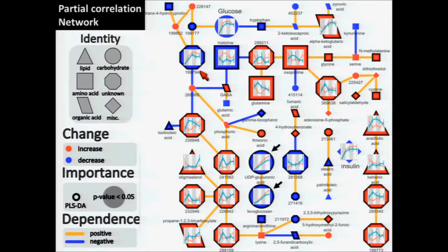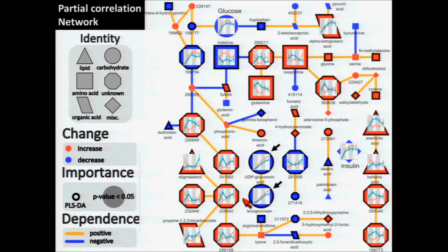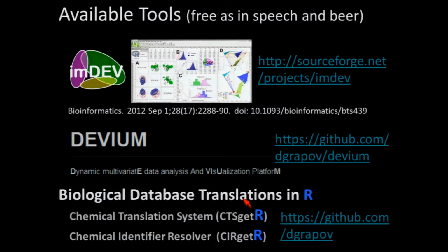And so some members of the Fiehn Lab, John Meisen and Kohei Takeuchi, went on to identify these unknowns, and it turns out that these are just partial derivatization products of glucose. This is glucose. So great. So it kind of validates this approach. So as you can see, this is a nice edge for connecting your unknowns, and really, your imagination is the limit of what kind of networks you want to do. So network mapping is very interactive. So I hope I got some of you kind of excited about this approach.